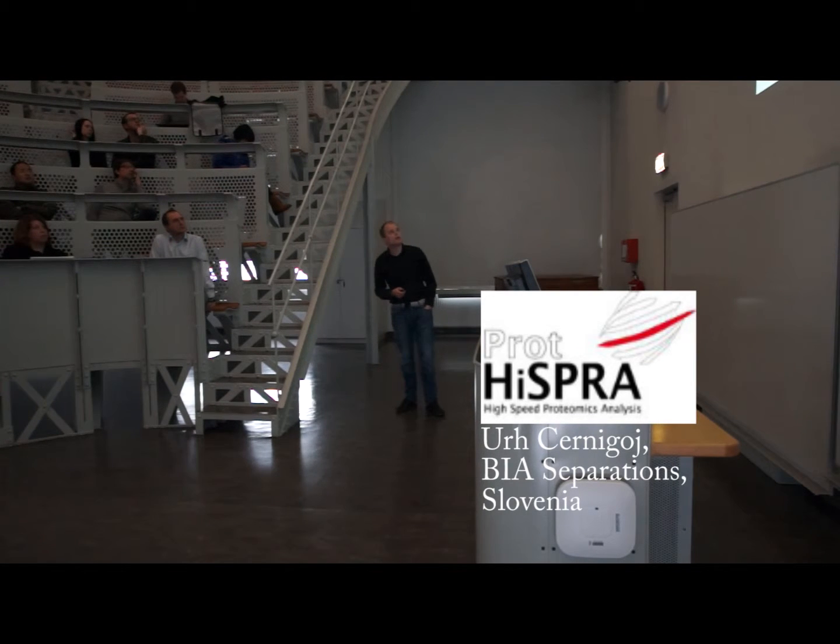This is the SEM image of the monolith. This is the monolith before the immobilization. So these black holes are pores inside the monolith. This is the titanium dioxide particles which were used. This is the TEM picture. You can see around 100 nanometers long needles.